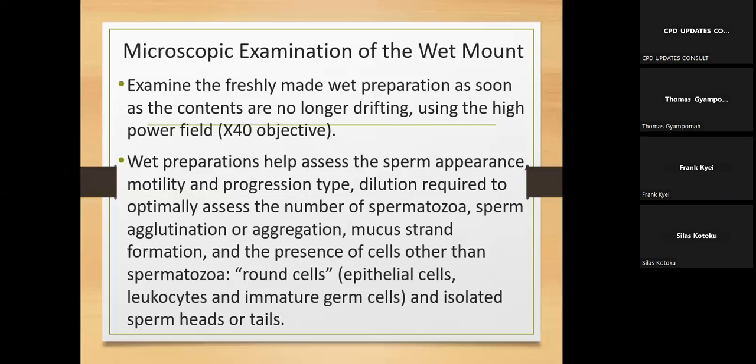Examine using the high power field, the ×40 objective. What magnification will that give you? If you use the high power field, what magnification are you talking about? Yes.